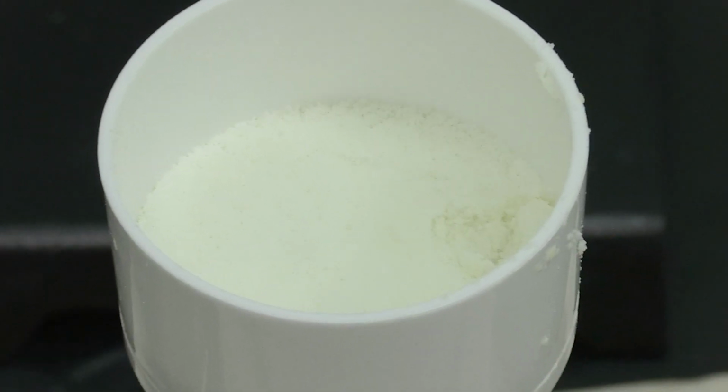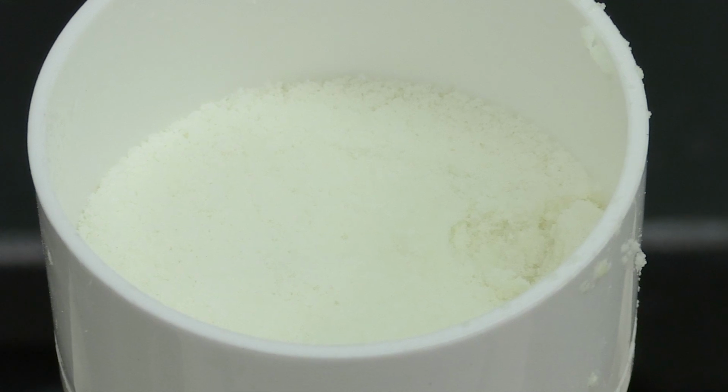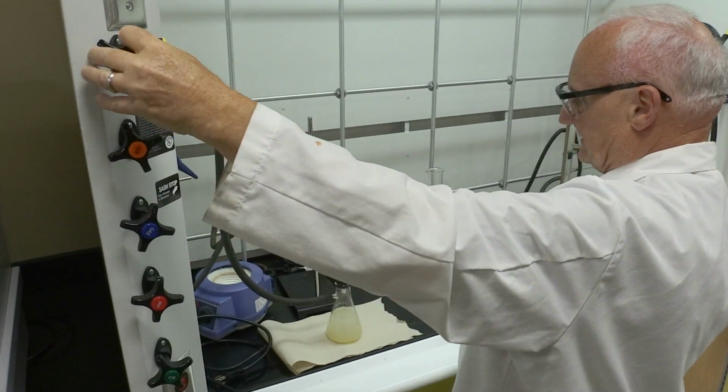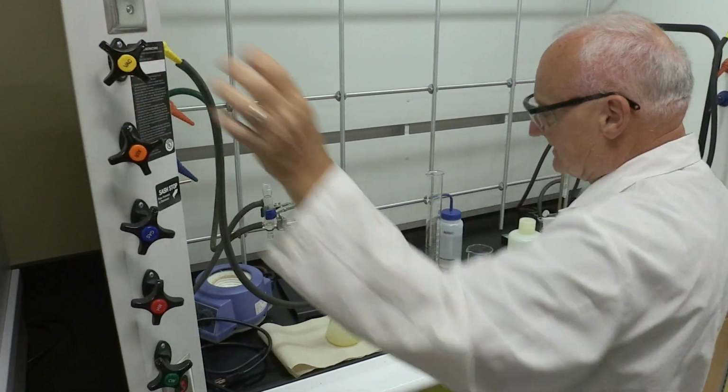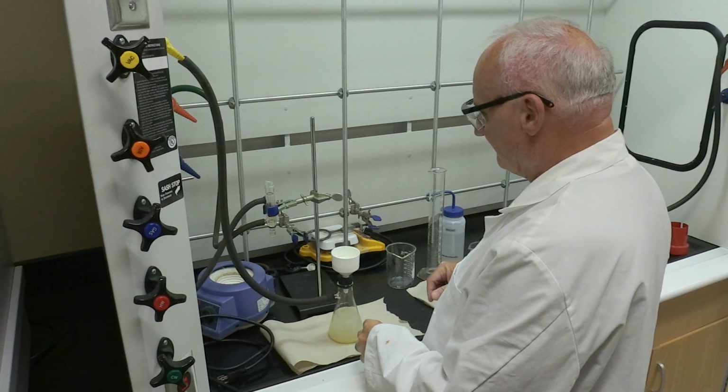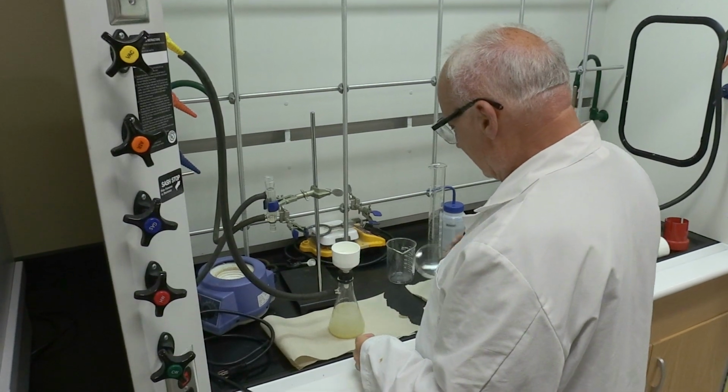Okay, we're going back to part A. We just finished the suction filtration. It took a little longer because it seemed to clog up the pores in the filter paper a bit. So now we'll remove it.